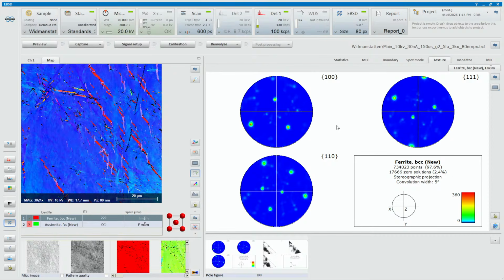This is very interesting. My background, I'm a material scientist, so to me, this is my native language. Inverse pole figures, the metallurgist side of me understands those, but pole figures, that's my first love when it comes to texture. So this is amazing that you could do it. Now, is this for the whole sample or is this for a pixel? This is for the whole sample.